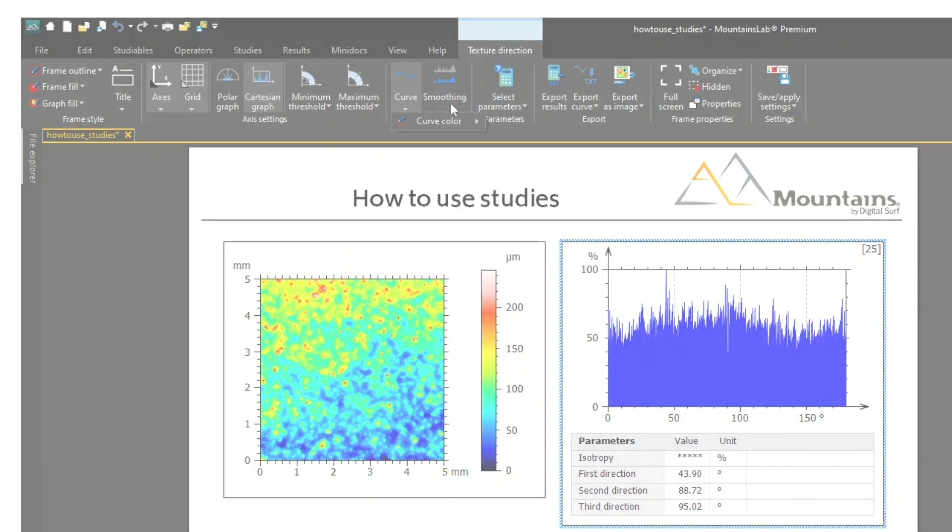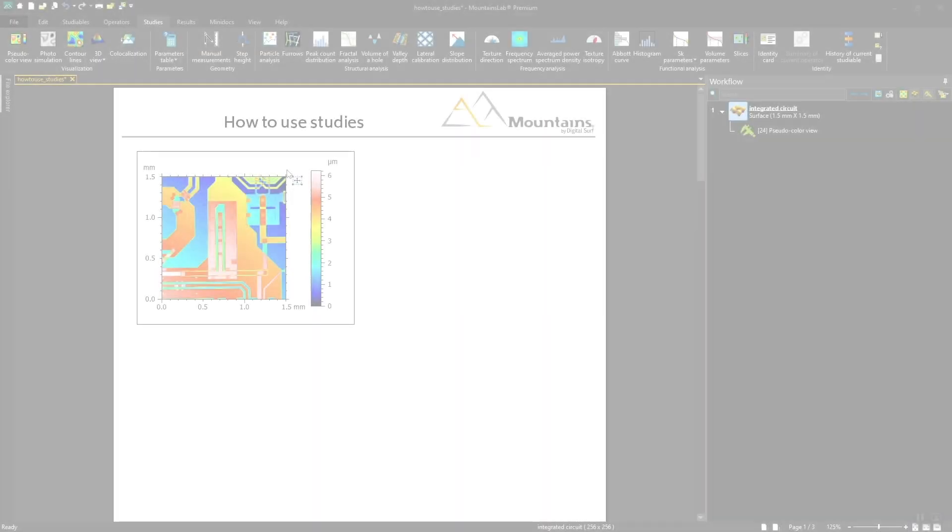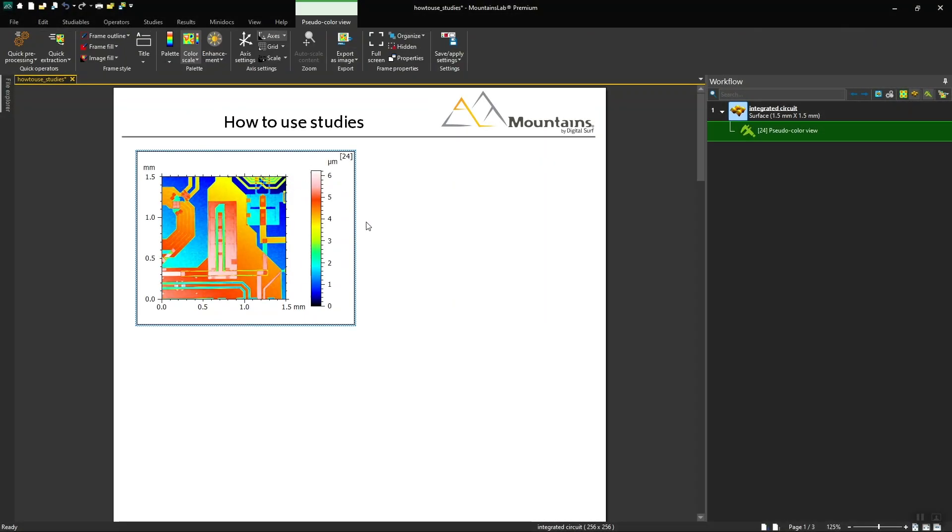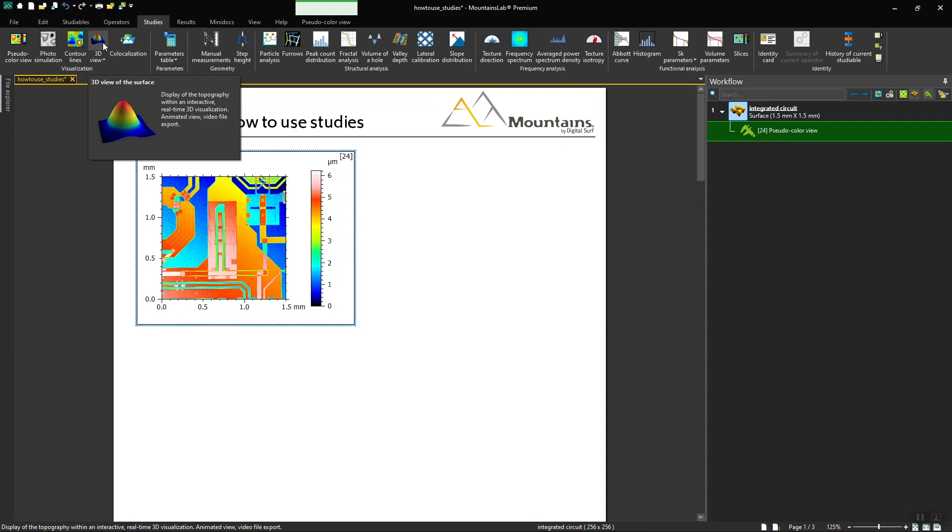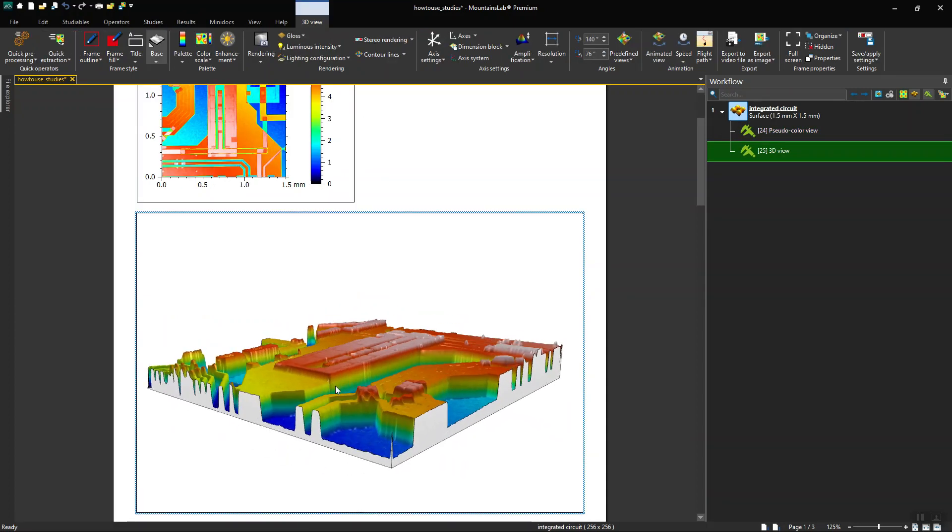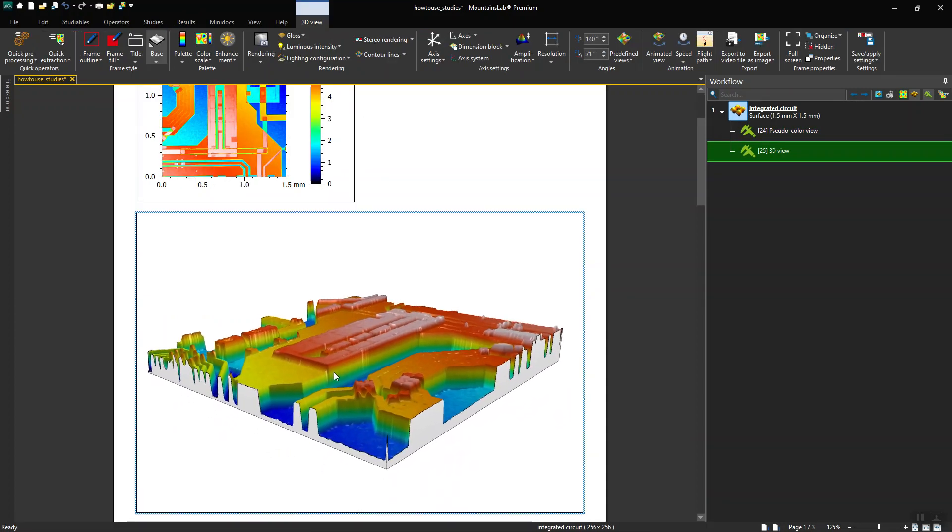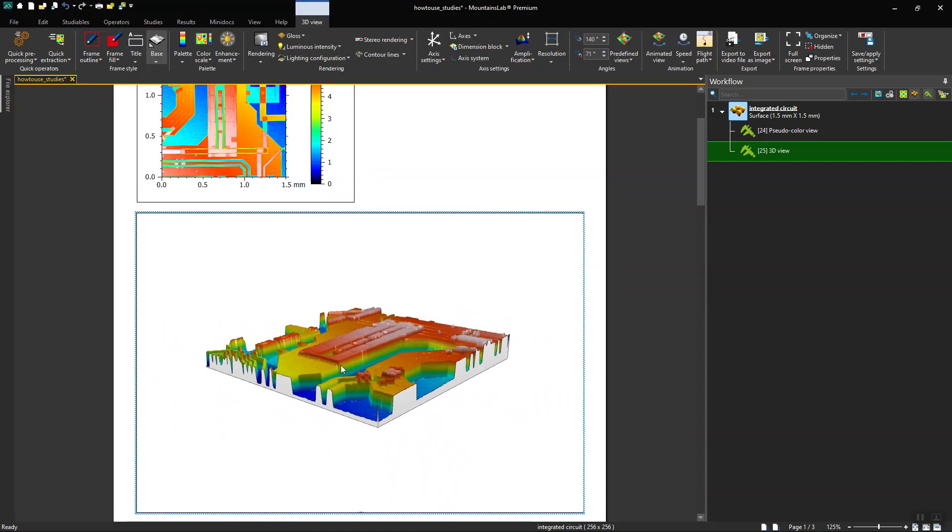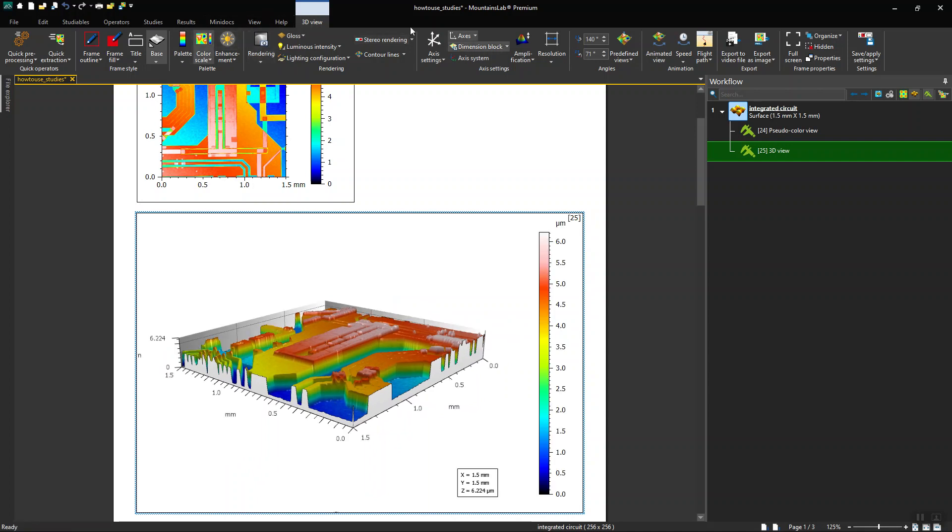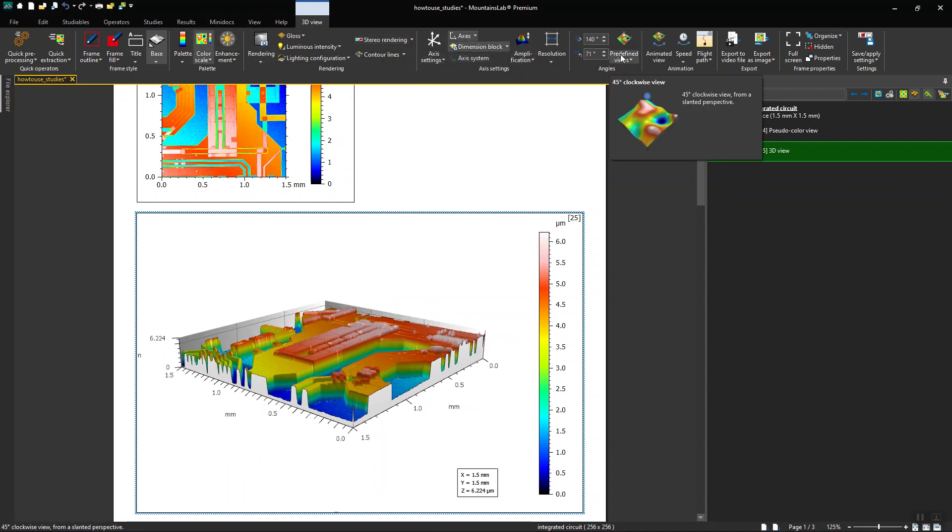Let's take an example. Here is a surface. I want to get a 3D view of this surface, so I use the 3D view study. My 3D view is directly generated in my document. I can now customize it to highlight the information that interests me most.